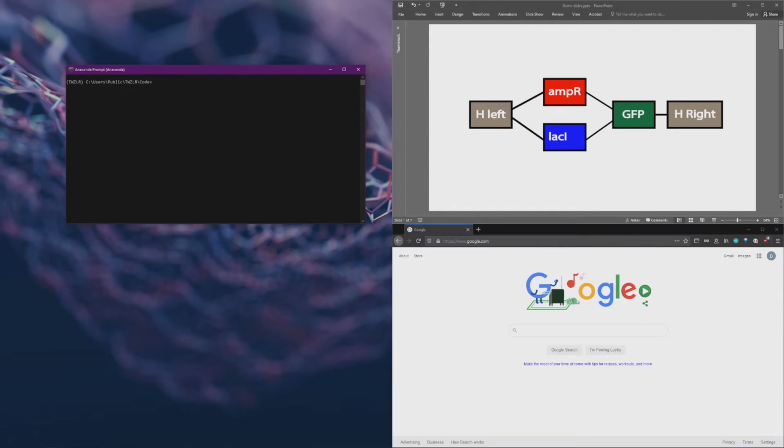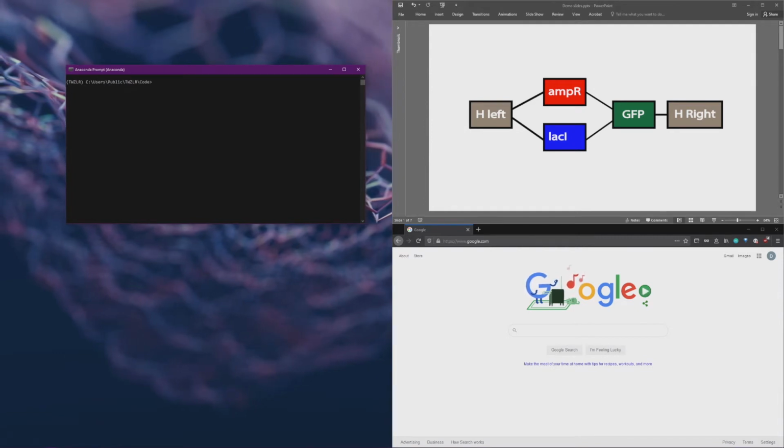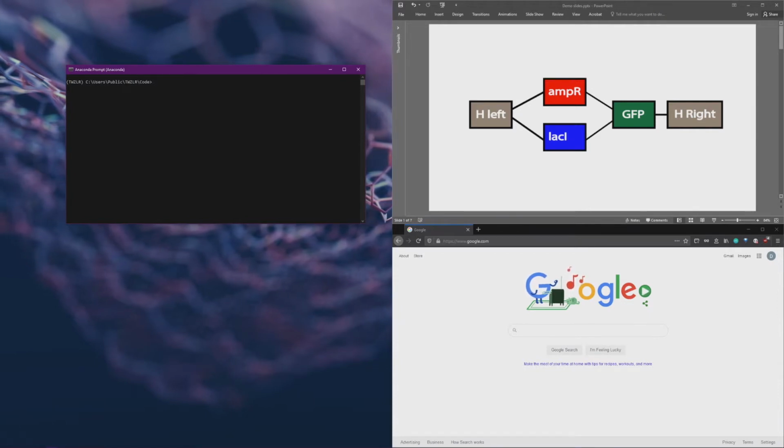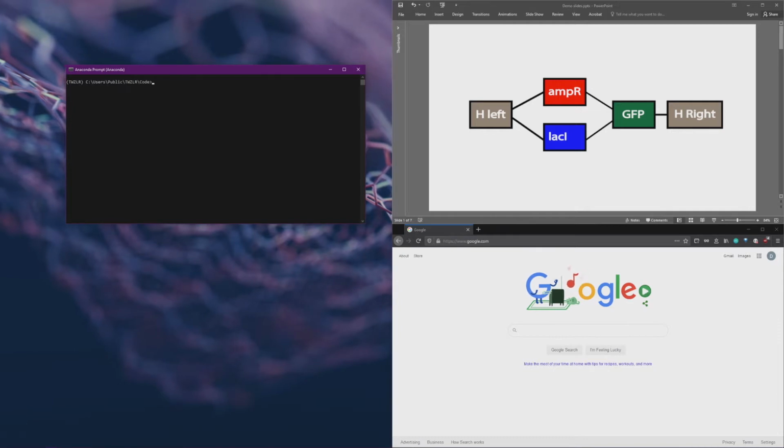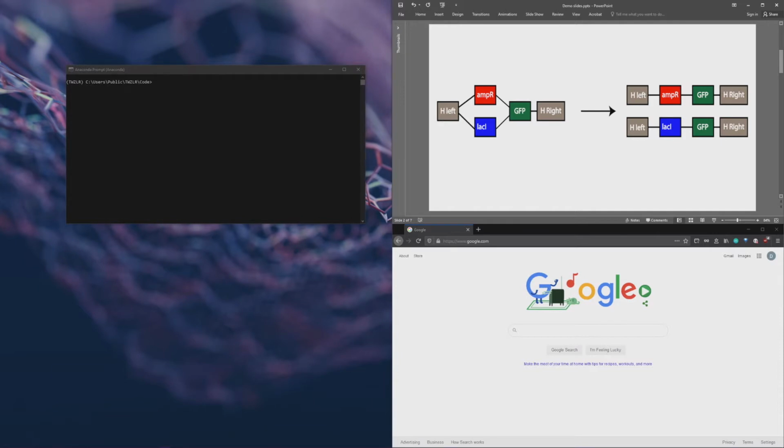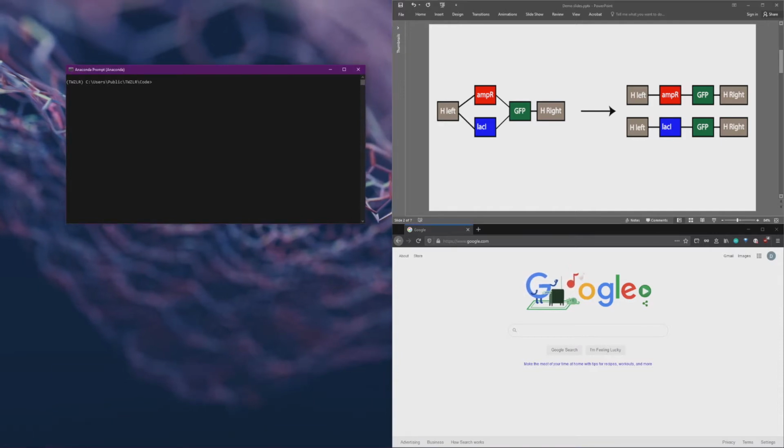In this video, we will demo the use of the primer creation tool Twzlr for gene insertion into Vibrio natriegens. This tutorial assumes that all of the necessary dependencies have been installed and the code folder in the repository is the current working directory. To facilitate the walkthrough of the tool usage, we will be constructing the basic combinatorial design shown. The tool will allow us to obtain the primers to construct all possible gene combinations found in our design, in this case, 2 of them.